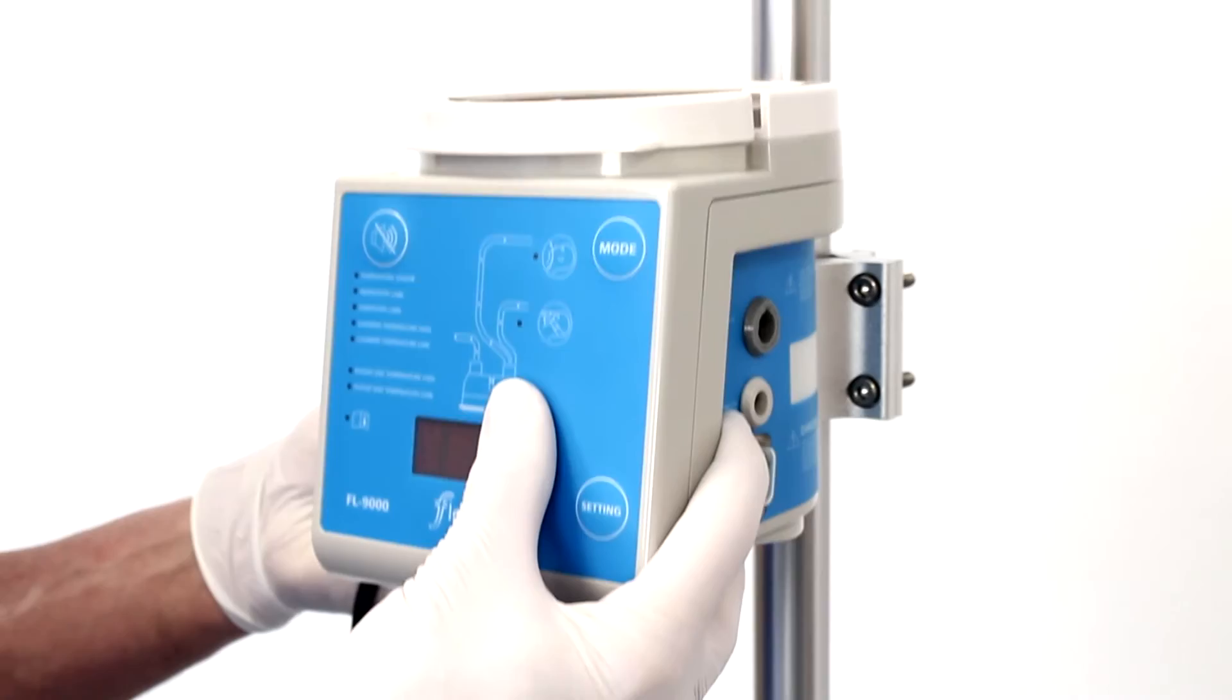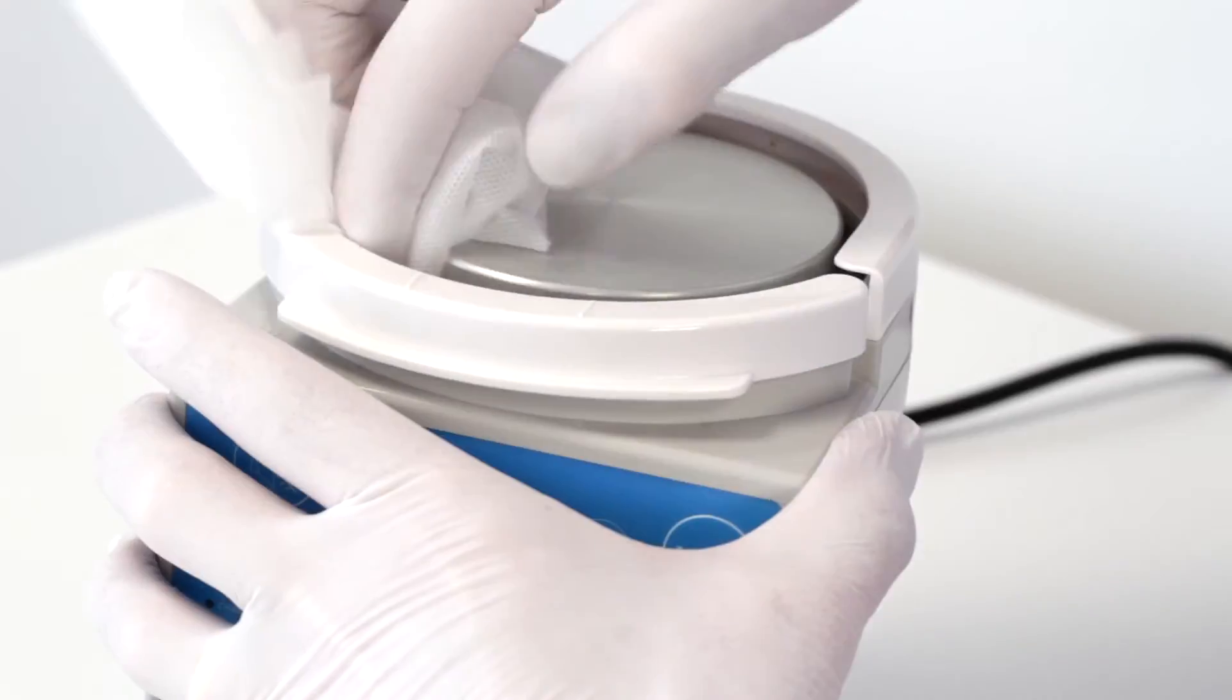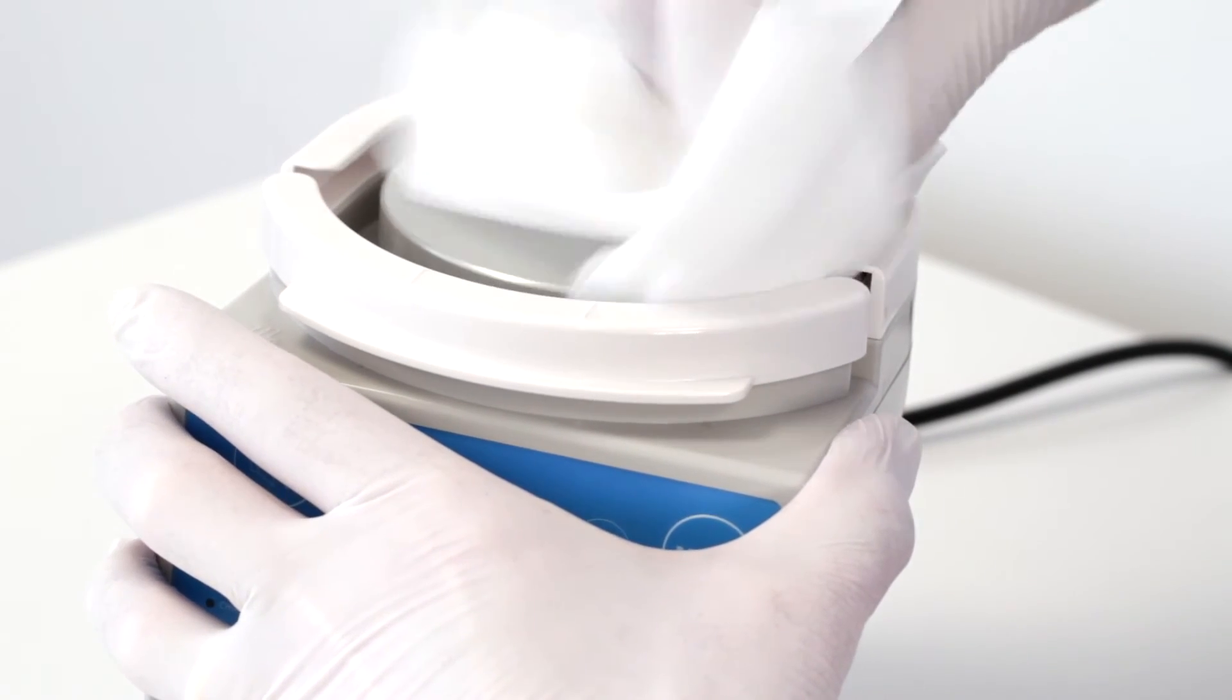Disconnect the FL9000 from the power supply. Wipe the surface with a soft damp cloth, 70% ethanol or an isopropyl alcohol wipe.